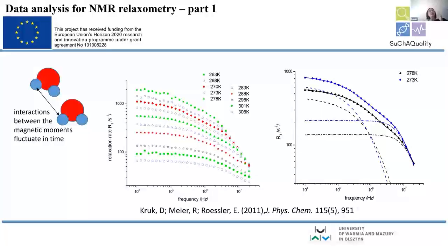And at time 0, let's say now, there is a certain orientation of the dipole-dipole axis with respect to the external magnetic field. Then the molecule moves chaotically, rotates chaotically, around its axis in all possible directions and planes. And after some time, we ask what is the orientation again of the line connecting those two hydrogen atoms. And the question is whether those two orientations, the initial one and the final one, are somehow correlated. Well, it depends, yeah? It depends how fast the molecule moves compared to the time we are talking about.